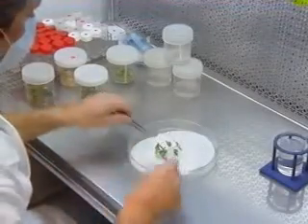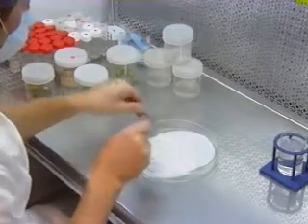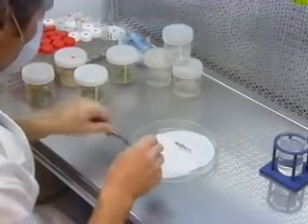To develop adventitious shoots on the explant, a somewhat higher cytokinin level is needed. For callus formation, increased auxin levels are also needed, but must be adjusted to an appropriate level of cytokinin. The culturing is done by cutting off the shoots and transferring the base to the new medium.